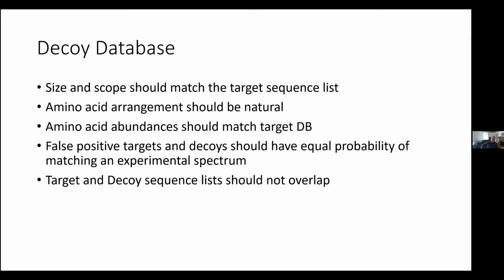As I said before, just randomly picking the 20 amino acids would be bad unless you already sort of predetermined the fraction of each one within the target database. Like, you could do it that way. This next thing is absolutely a key.